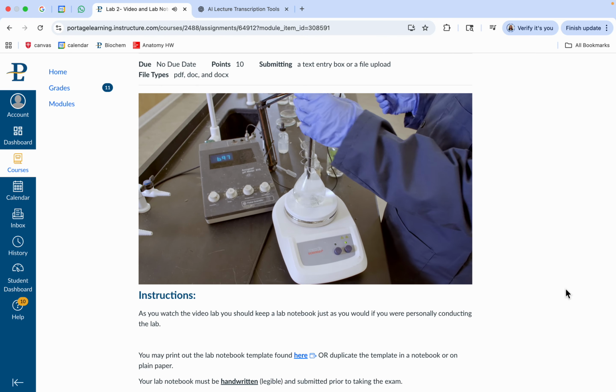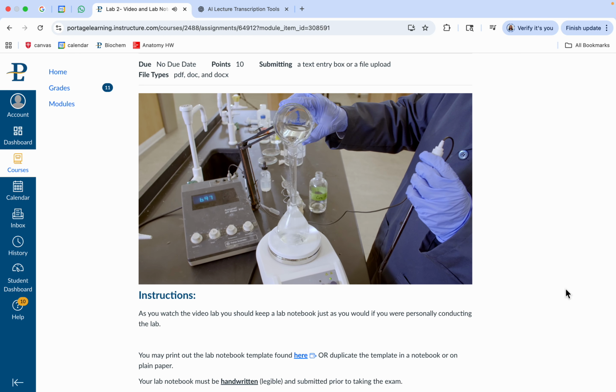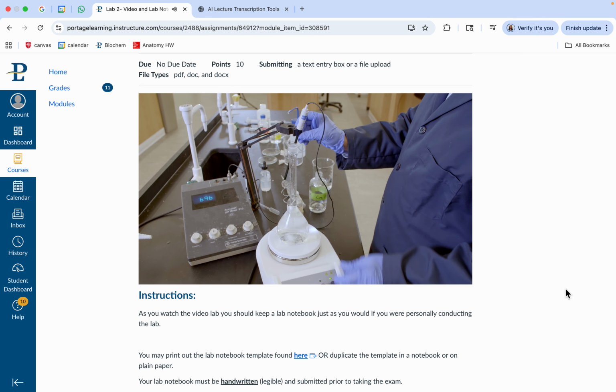It raised up just a bit, and that's actually pretty good for a pH 7 buffer. We can add a little bit of HCl if we wanted to adjust the pH. So we'll leave it there, pretty happy, but that's sometimes over titrate. And so we're good there.